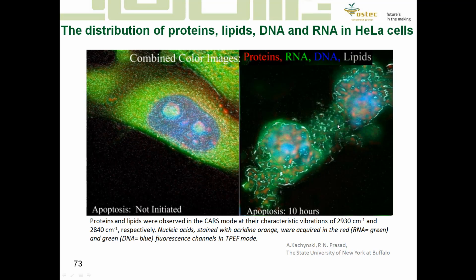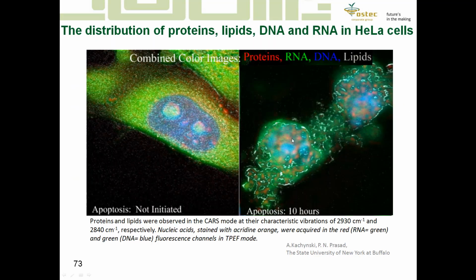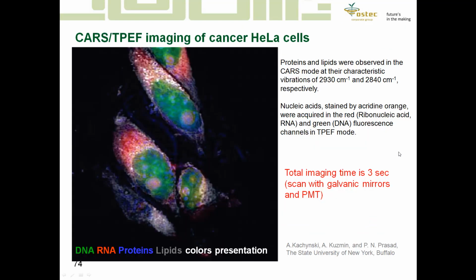And it's especially important for living cell measurements, because we cannot excite them with visible range excitation lasers, and with infrared they are quite stable. Especially for living cells, the fluorescence is not excited when we apply excitation in the near infrared region, and the anti-Stokes beam has shorter wavelengths than the excited fluorescence, which is also a big advantage for biological samples.